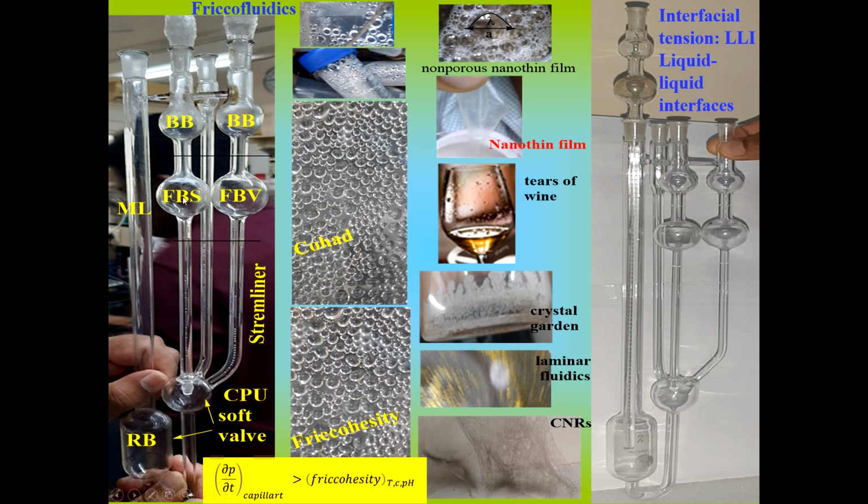Suppose there are macromolecules, or complex molecules. So when the sample comes to this side, it's a functional bulb. These lines are there, and then again this solution is taken to this side. So this is a buffer bulb, because when we are pushing and lifting the sample, it is a little bit under stress. I have already explained the rheology. So it gives some time so that the molecule gains its original state. It becomes in the rest position, equilibrated. That's why the buffer system. So this survismeter is a very ultra-accurate device which senses each and every activity of the molecule.